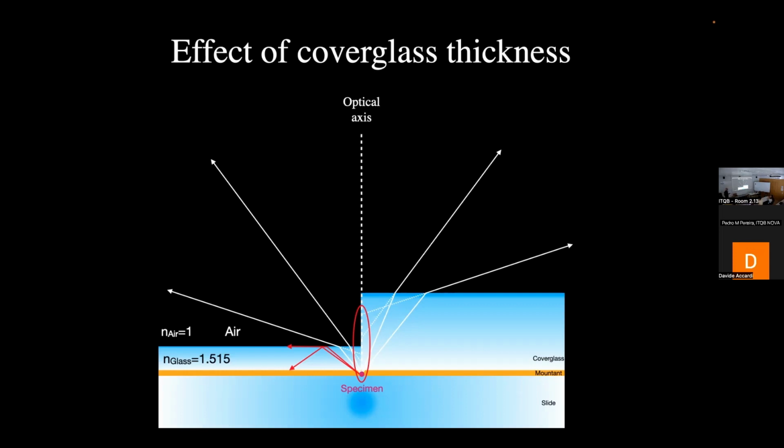If you are imaging something very thin at the cover slip, for example a monolayer of cells, then matching the refractive index of glass plays a much more important role than matching the refractive index of the watery medium, for example of your cells, because you are imaging at the glass. All right. So I hope that these considerations will be important for you.